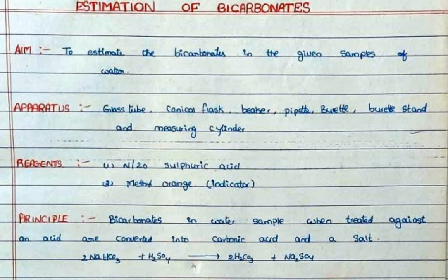Principle: bicarbonates in a water sample, when treated with an acid, are converted into carbonic acid and salt. Equation: 2NaHCO3 plus H2SO4 gives 2H2CO3 plus Na2SO4.